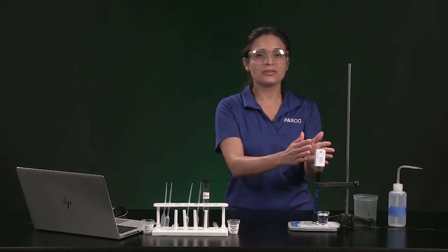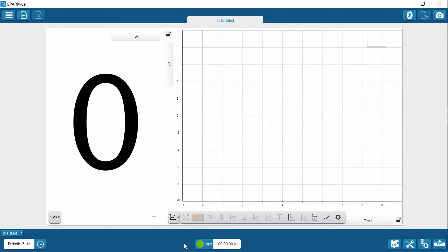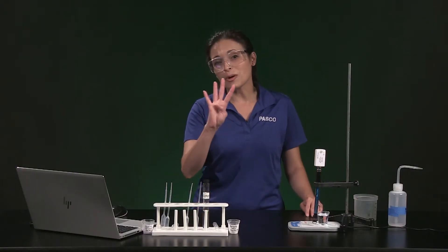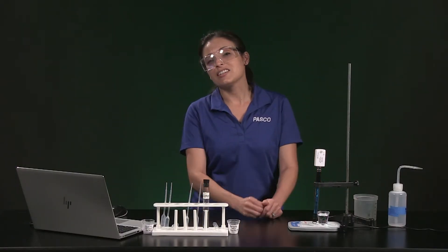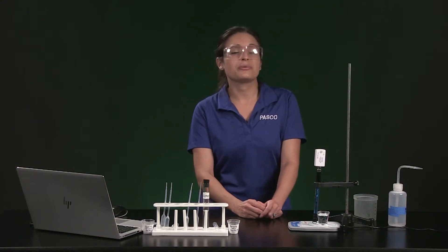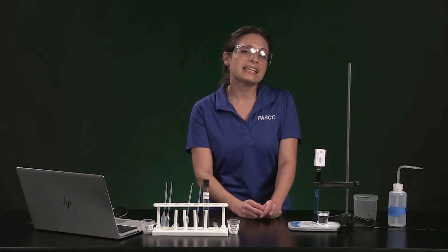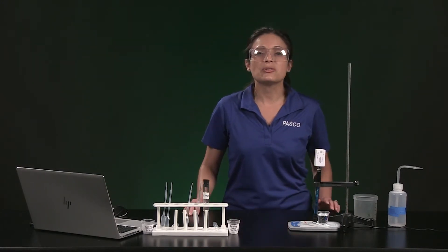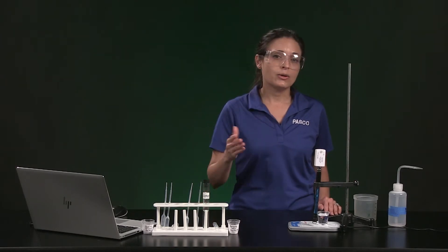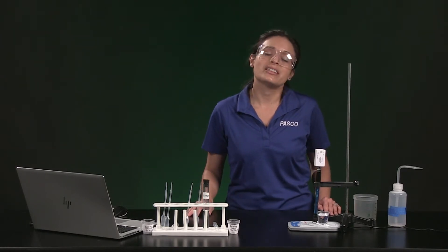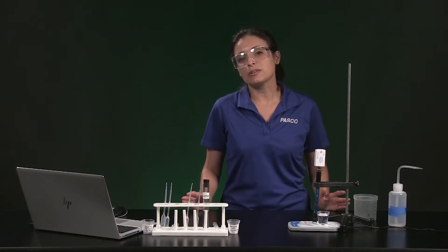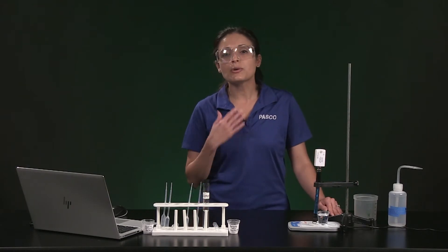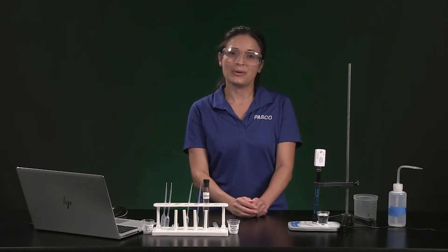I have already connected the pH sensor to my computer, so we are ready to start the investigation. There are four parts to this investigation, and because the final part of the procedure is intended for your own experiment design, your teacher may have you use my data, or they may ask you to collect your own data. Just be sure to follow your teacher's directions, and only record my data if your teacher says to do so.